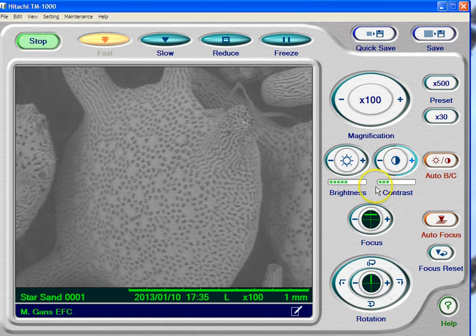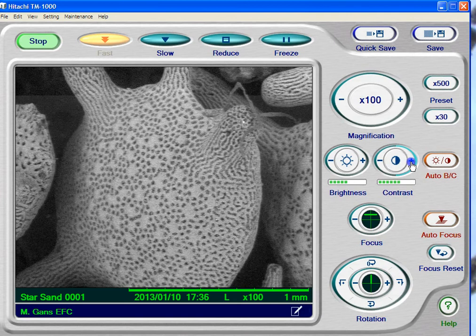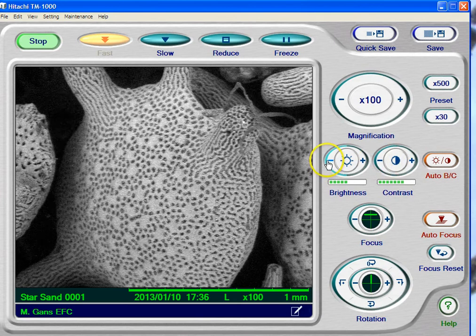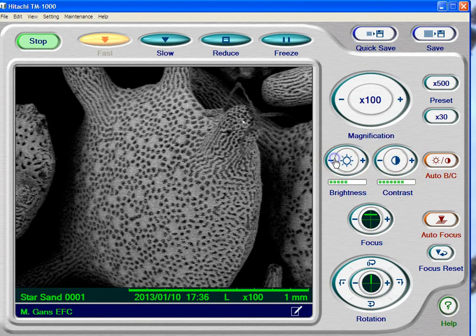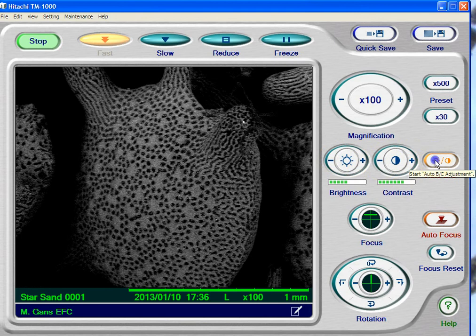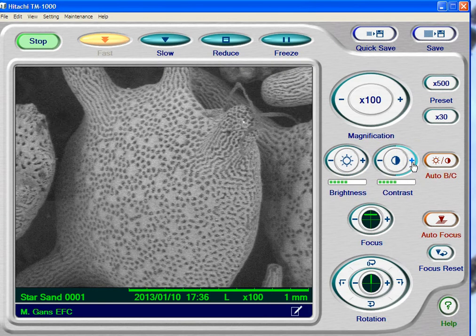You can also see that I've got brightness and contrast controls. These are really key to seeing a good image — if your brightness and contrast are off, you're not going to get a high quality image. I can increase the contrast by clicking this button slowly, and every time I click it the contrast changes. Or I can hold it down and see a little bit more each scan. I can also drop the brightness down a little bit. If you get it completely out of whack, just click auto brightness and contrast again and it'll reset. I like a little bit more contrast on my images, so I'm going to increase that just a bit.